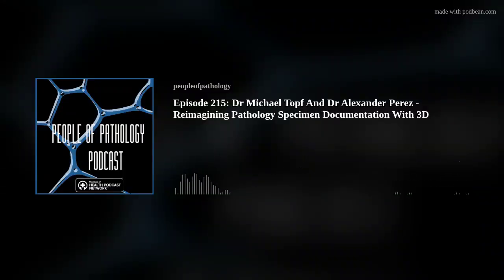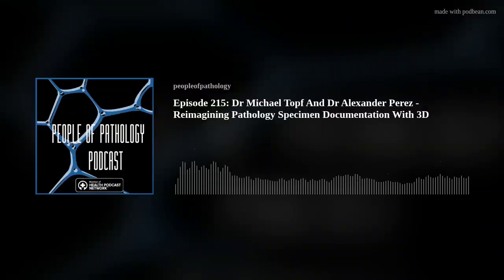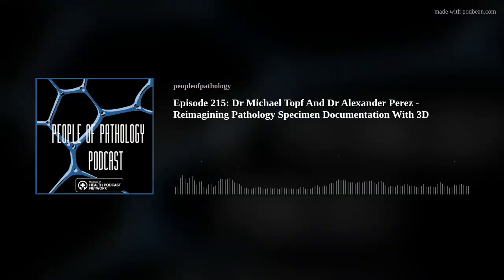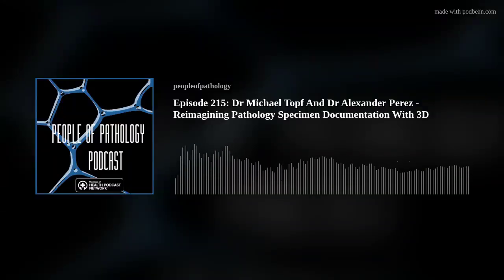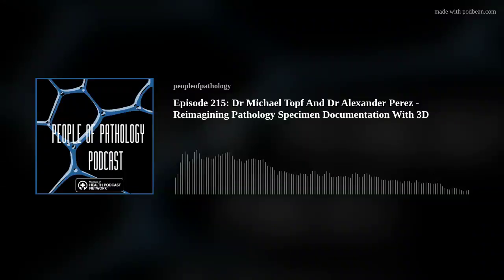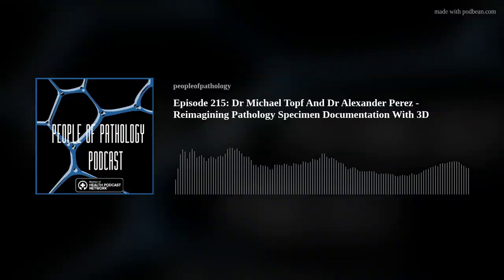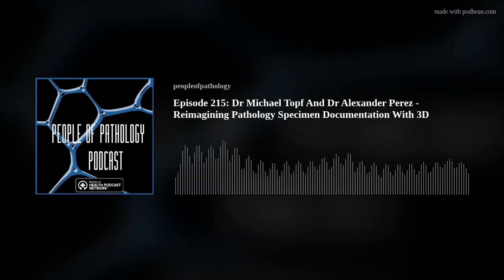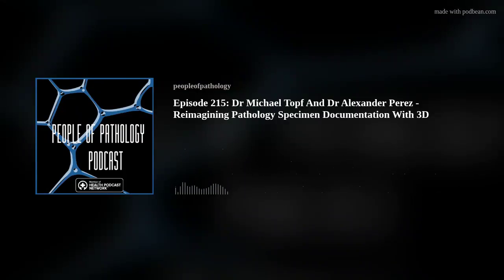And then from the pathology side of it, the biggest thing I've always had an issue with is how it almost feels like a game of telephone. You have a surgeon who's taking a specimen out, so they see it in situ, and they're usually assisted by radiology, so they have an idea in their head of what they're going for. They take a specimen out. Then, depending on their workflow, they either bring that specimen to the gross room themselves or just send it off in a container. So you already have your first chance for a disconnect, where the person who took the specimen out is just writing on a piece of paper, this is anterior, this is posterior, and then orienting the specimen. Someone else, totally separate, who didn't see it in situ, receives the specimen and, to the best of their ability with those instructions, orients the specimen, then prosects it.